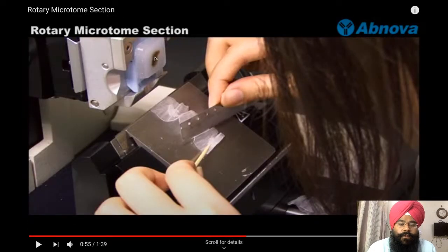Here you are seeing a section of an organ of a mouse, put in paraffin wax, and that's how we see the results.